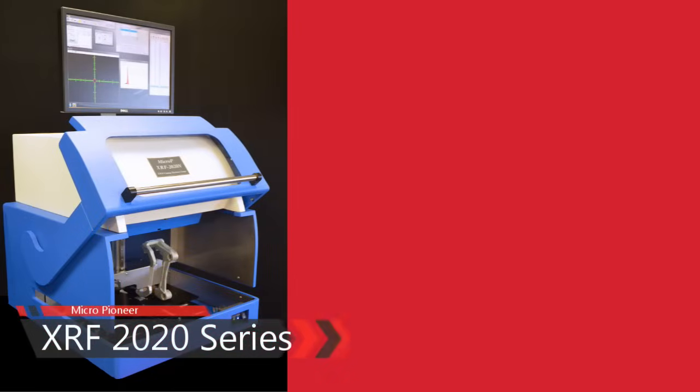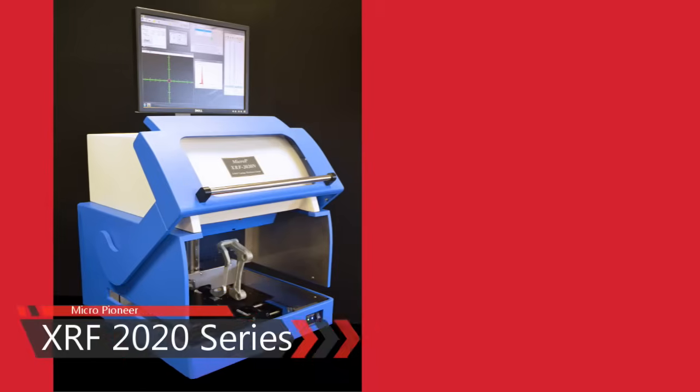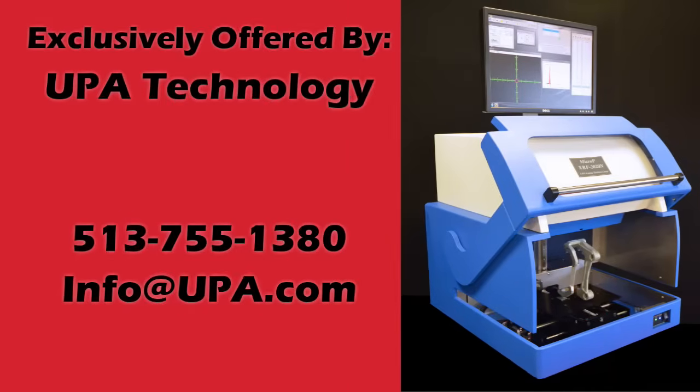Presented for your review and consideration, the Micro Pioneer XRF 2020 X-Ray Series, exclusively offered by UPA Technology for plating thickness measurement and materials analysis.